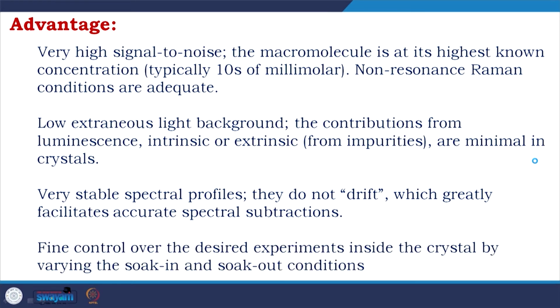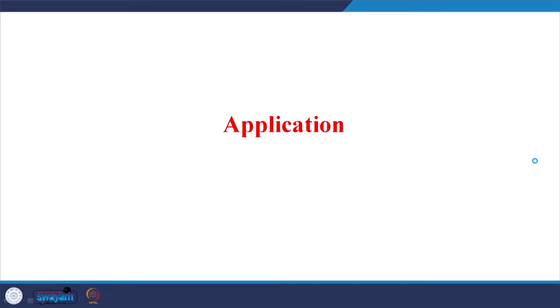Fine control over the desired experiment inside the crystal by varying the soak-in and soak-out conditions. So, you could change the concentration of the small molecule, you could change the small molecule, you now have another platform to do a beautiful range of experiments.